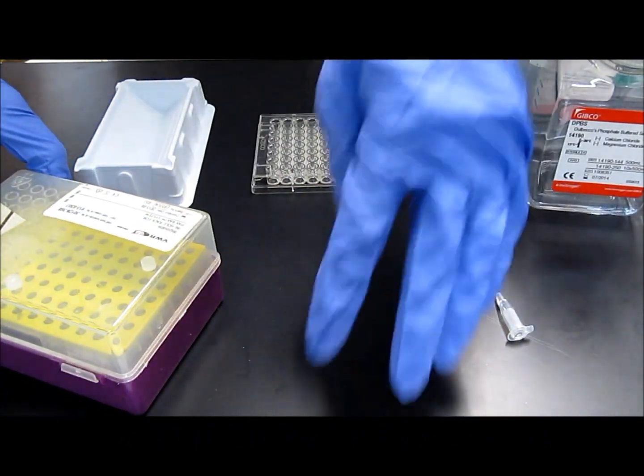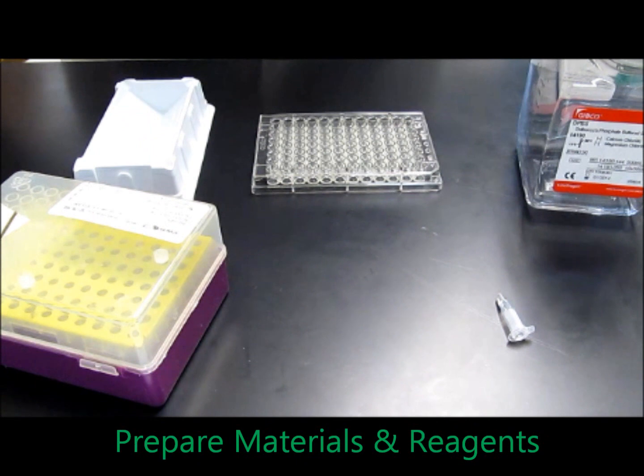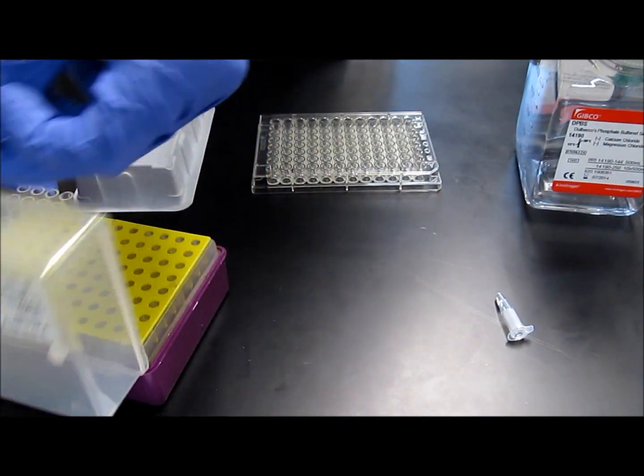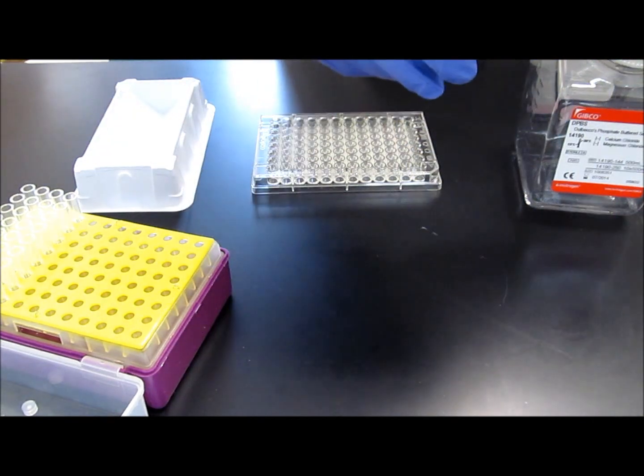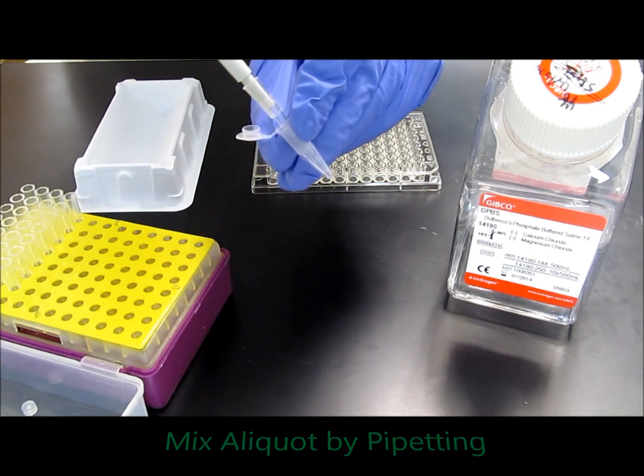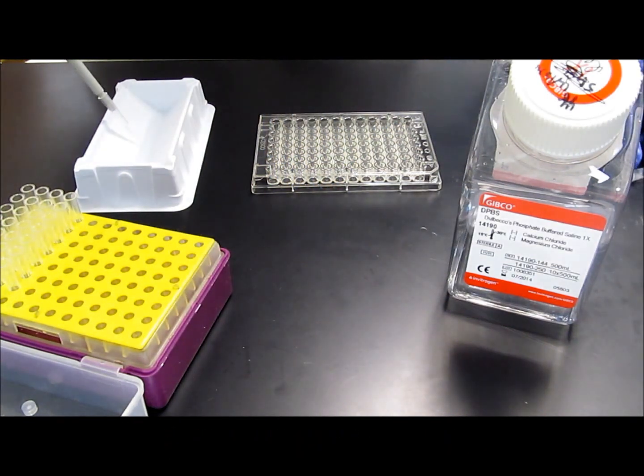After that, you're going to prepare all of your materials and reagents. The materials you're going to need include your pipette tips, an empty reservoir, the 96-well ELISA plate, some DPBS or PBS, and a vial containing an aliquot of capture antibody. Using your pipetter, mix the capture antibody aliquot a few times to make sure the antibody is distributed, and then place the droplet onto the empty reservoir.